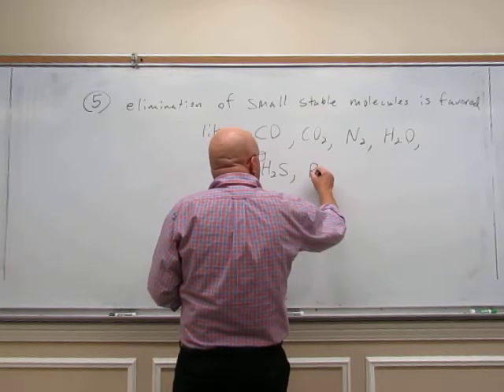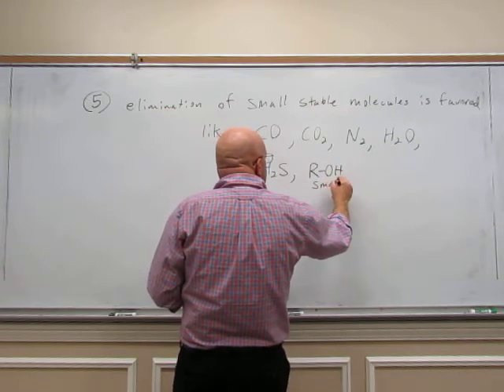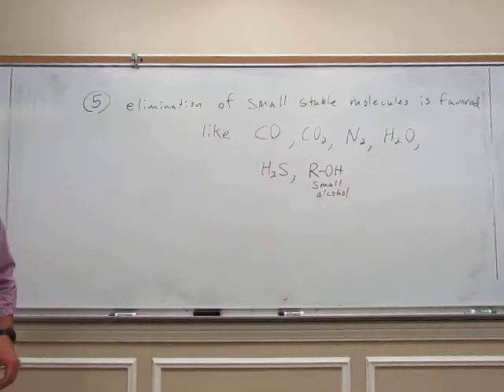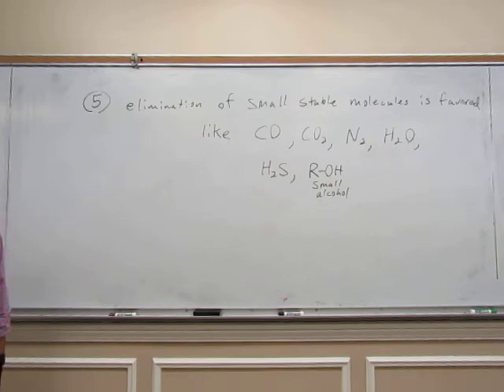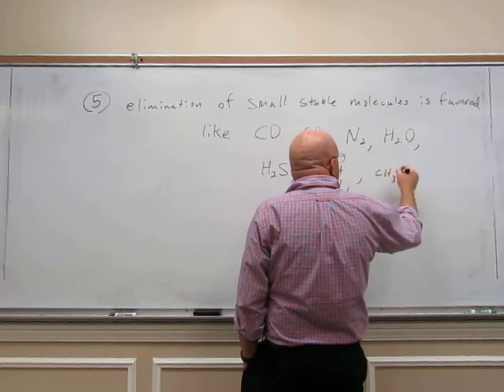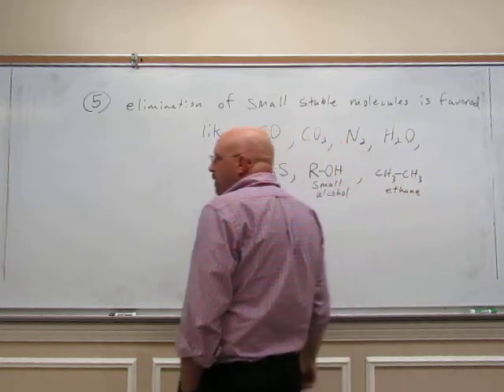Maybe some small alcohols sometimes. Not anything too big, but sometimes you can eliminate a small alcohol. Okay, so those are some. I'll just leave it there. There are others, but those are probably our most common. I'll put one more. Sometimes we eliminate ethane. Ethane's nice and stable. Sometimes it will eliminate an ethane molecule.